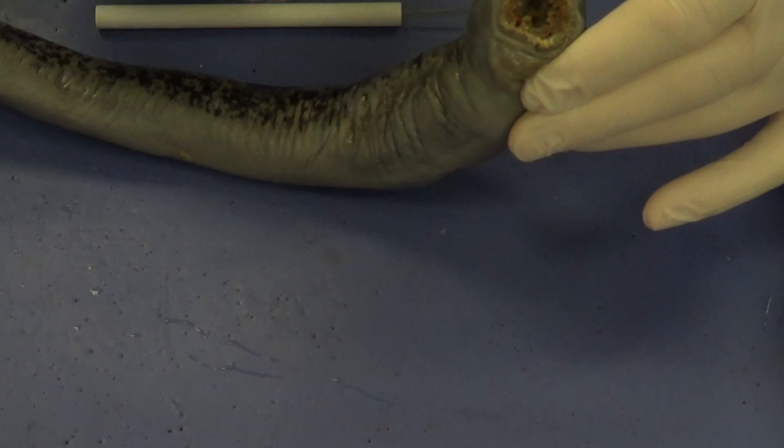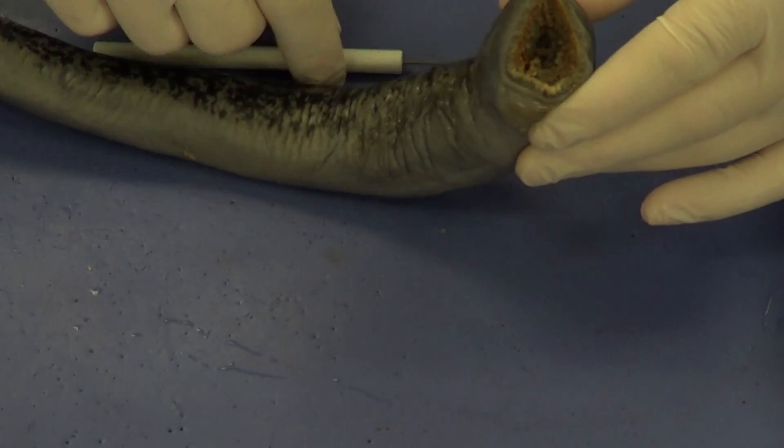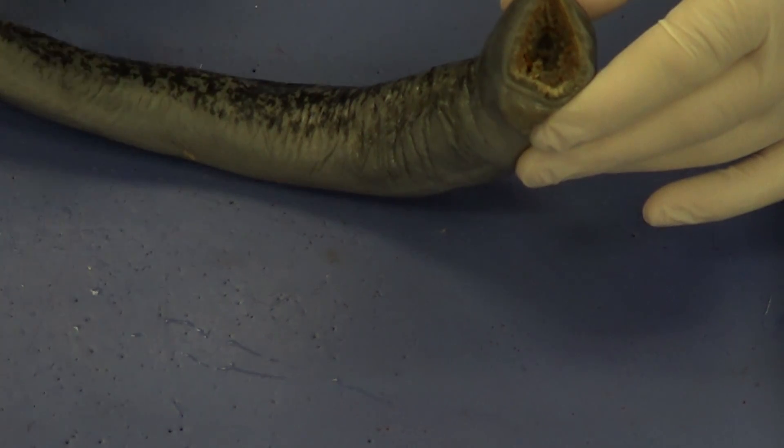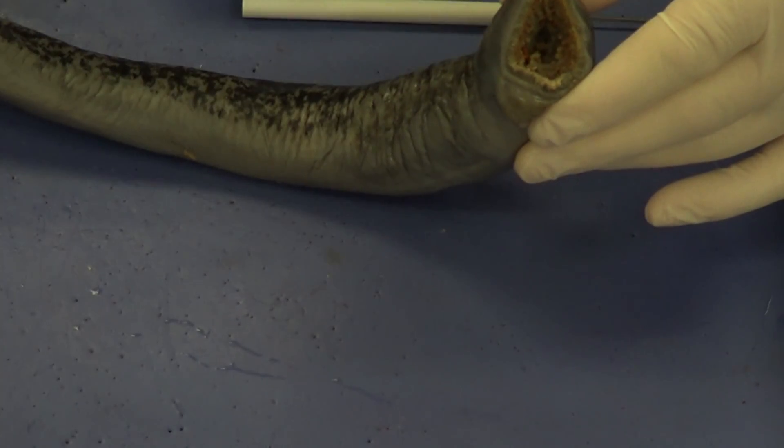These also latch onto the side of the fish and drill a hole in the side of it. Eventually, the lamprey sucks the blood out of the fish — that's its nutrients — and leaves the dead fish to basically sink to the bottom.